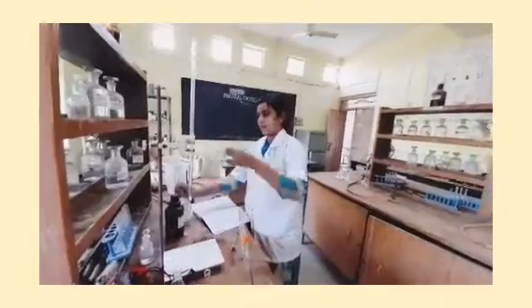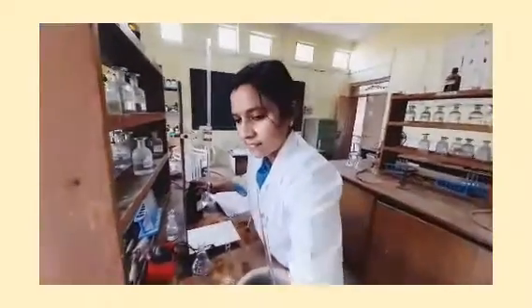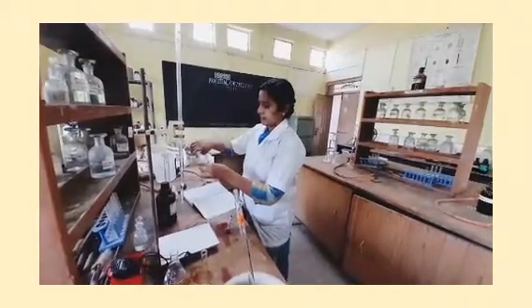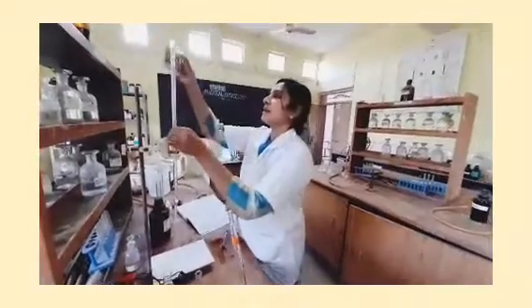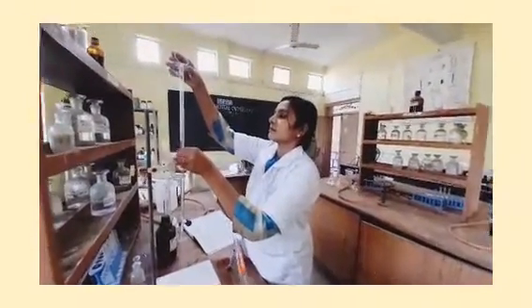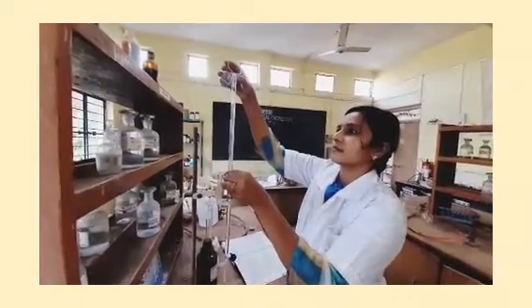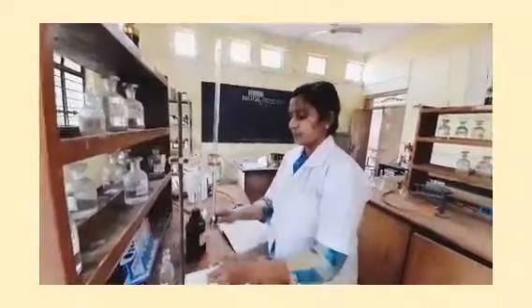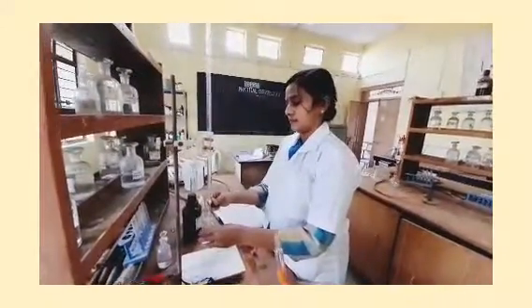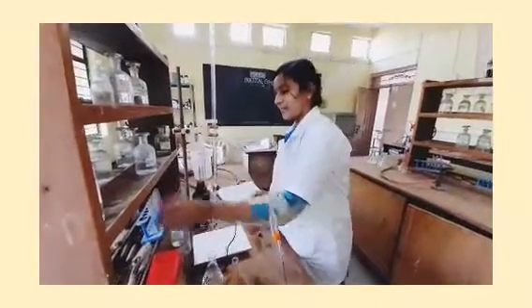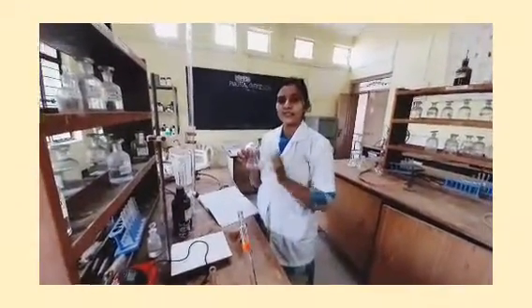This reading has been completed. The burette is now empty up to 14.6, and therefore I just fill up the burette again with 0.1 normal NaOH. This second conical flask is already ready, in which I have already added cold water and phenolphthalein indicator — two drops.